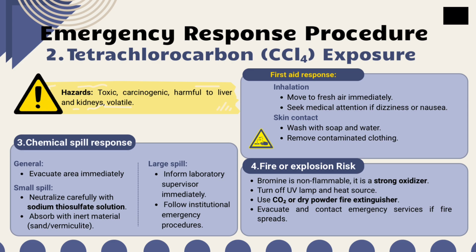In the event of a chemical spill, the area must be evacuated immediately and appropriate personal protective equipment should be worn. A small bromine spill can be neutralized using sodium thiosulfate and absorbed with inert material, while a large spill must be reported to the laboratory supervisor and handled according to institutional emergency procedures.